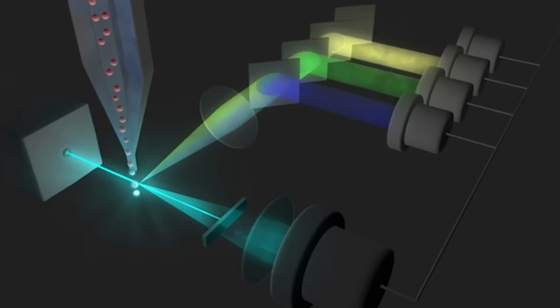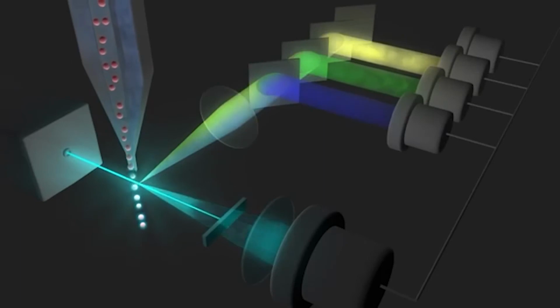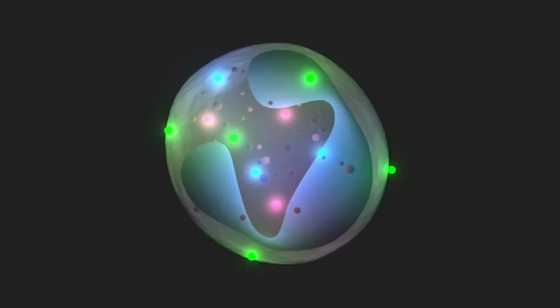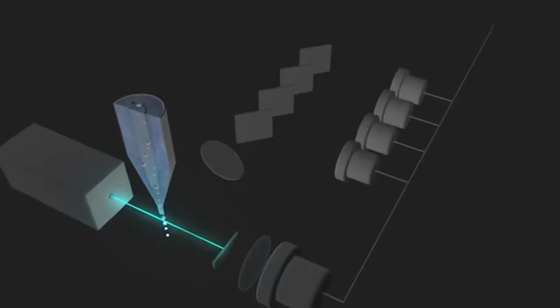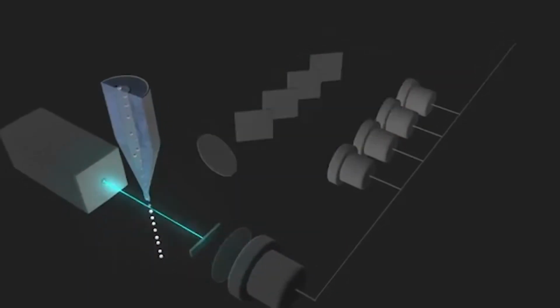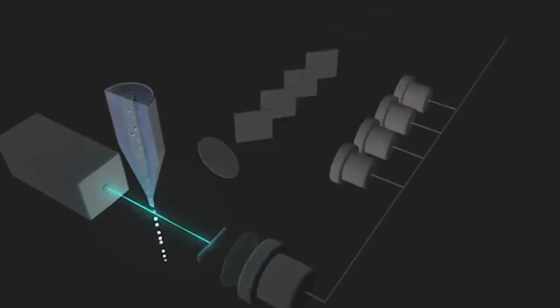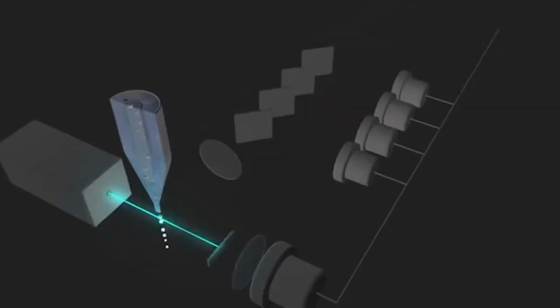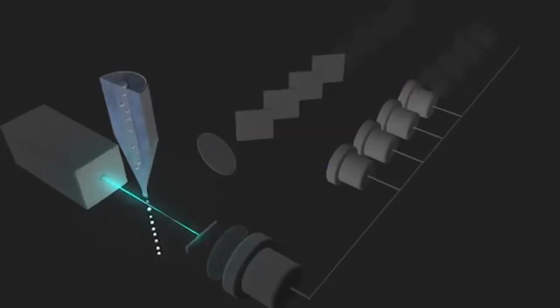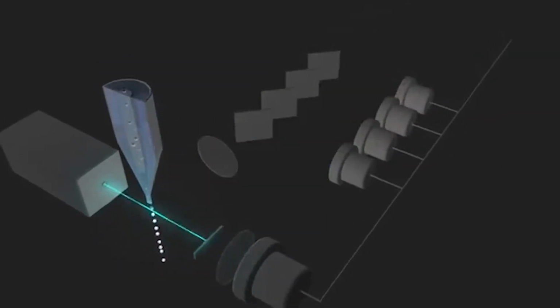The fluorescent molecules, or fluorophores, are excited by the correct wavelength of the laser beam as they pass through the laser beam. After excitation, the light emitted by the fluorophore is directed along the path with the emission filter, allowing the detection of multiple different fluorescent emitting lights in a single cell. A flow cytometer can detect not only the presence of a fluorophore, but also the quantity and relative amount of a fluorophore within a cell.